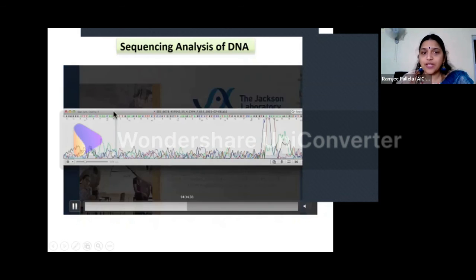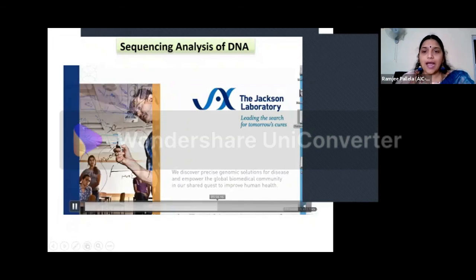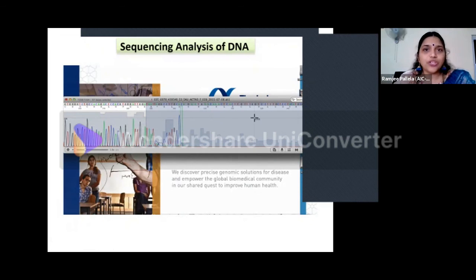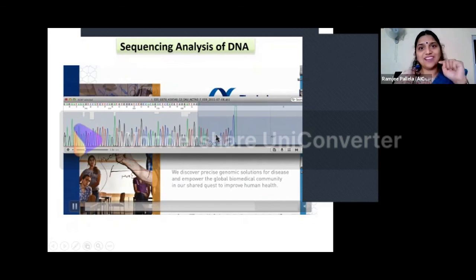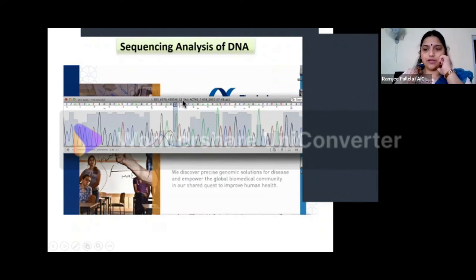So if you have the ABI software in your college or in your research institute where you are going for further research, you can do it this way. Okay, I don't think that unless you do this particular analysis, you will be able to get it properly. However we give you a demonstration about this technique, unless you sit on your Macs for this, you will not be able to do it. I have done it for 3.5 years, and it is tedious, but every single base pair you have to actually read. So it becomes difficult when your amplicon size is a little bigger. Okay, so this is how you analyze your sequence data.